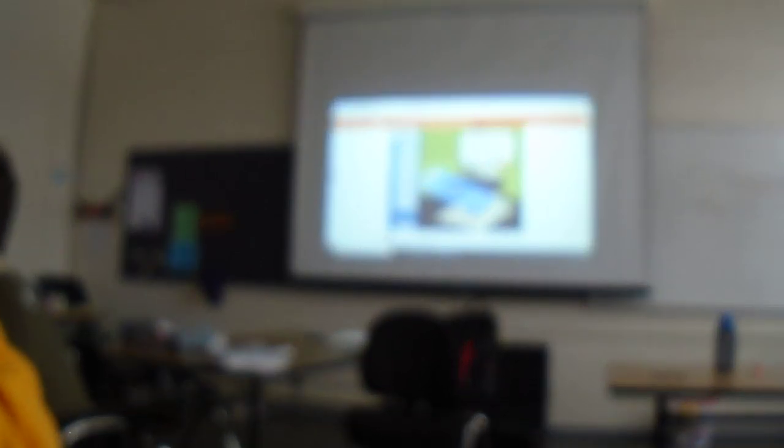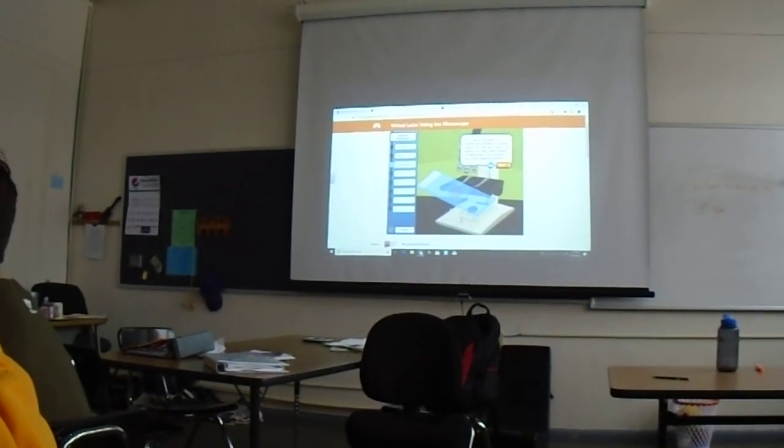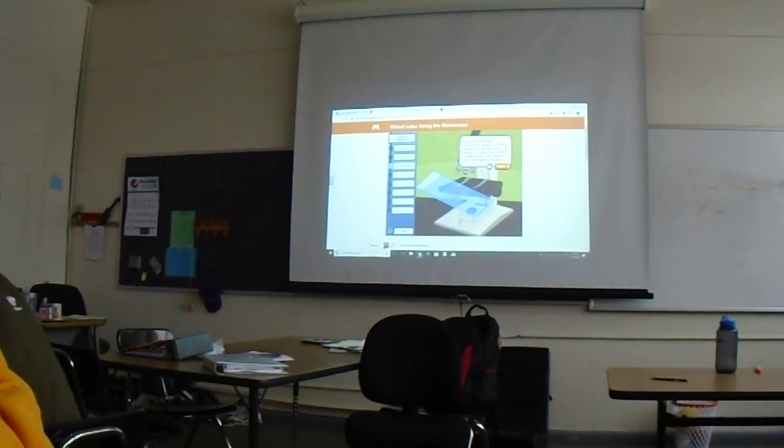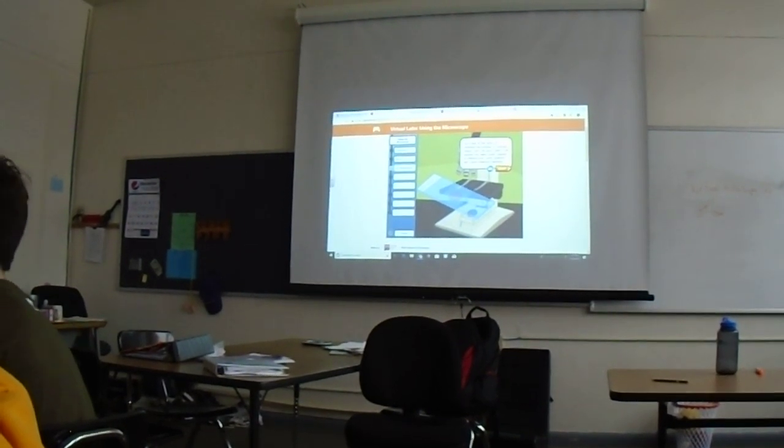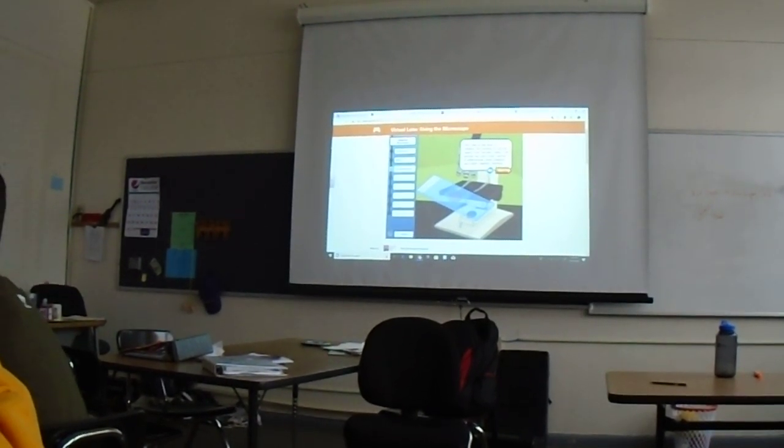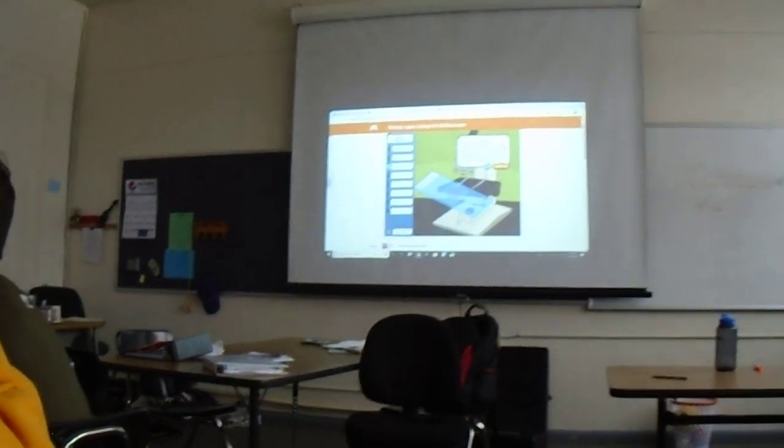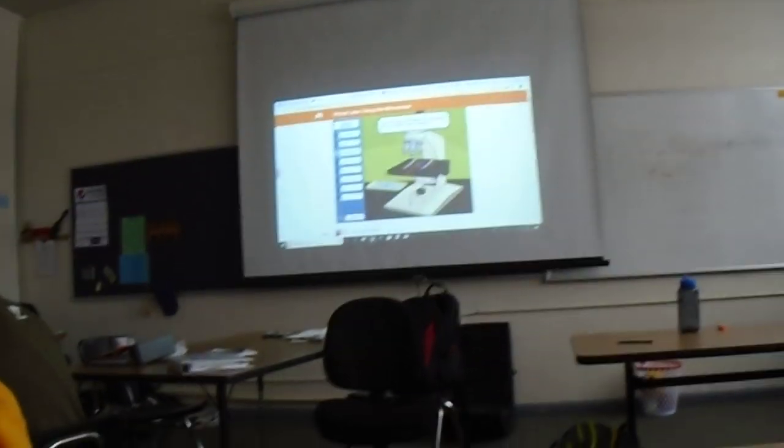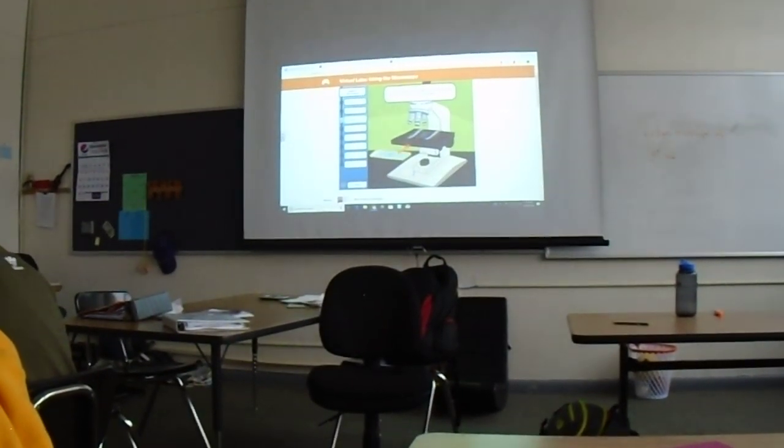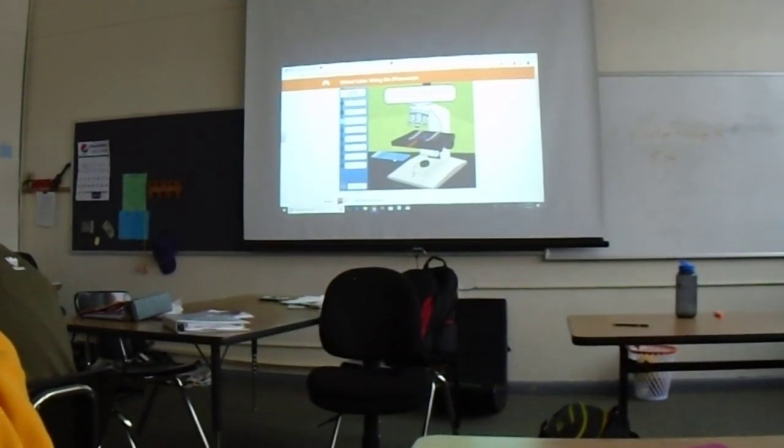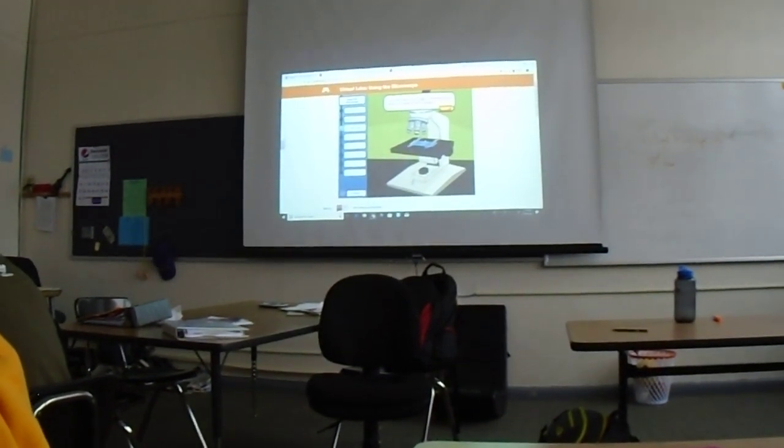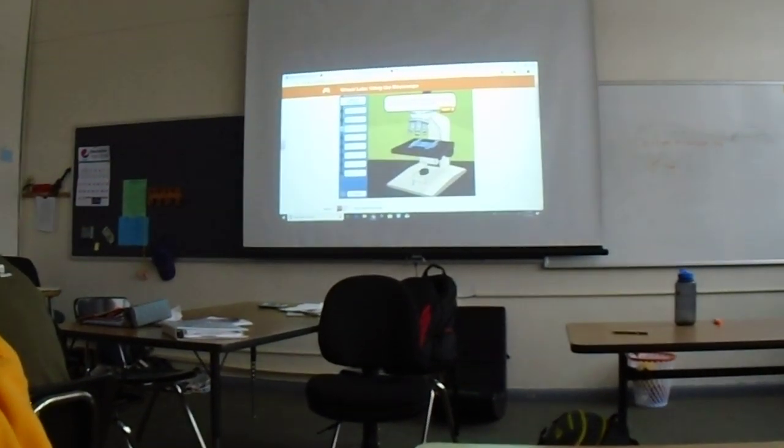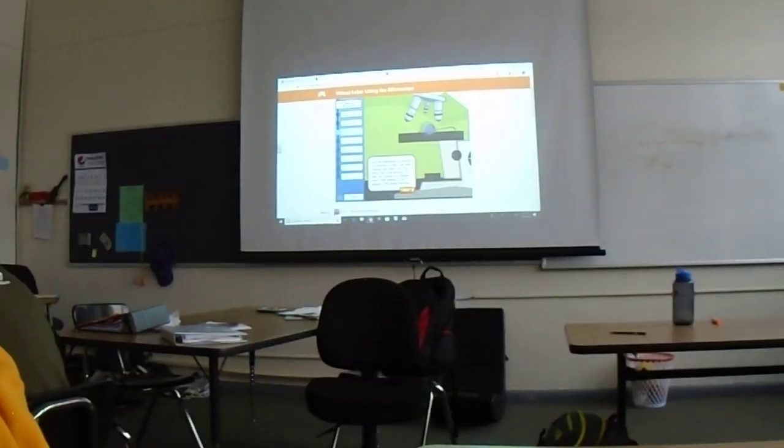Let's look at the slide. It contains the sample of cultured yogurt from the dairy plant. The sample has been gram-stained to differentiate gram-positive and gram-negative bacteria. Okay, that doesn't mean anything to us because we're just trying to set up the microscope. On the stage of the microscope, secure the slide to the microscope. Okay, so we're just going to take this slide, slide it in, under the stage clip so it's secure. Click next.